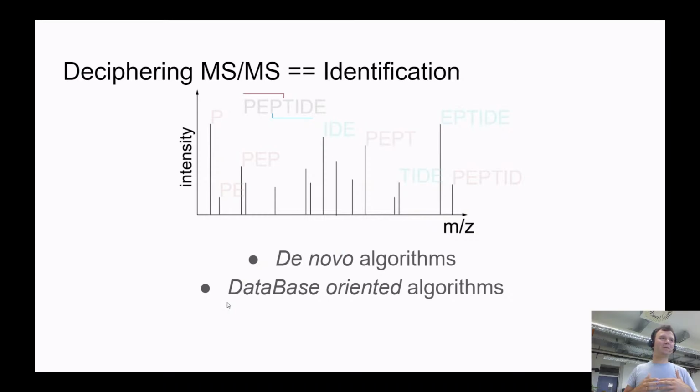Let's say we're analyzing some unknown species, and we're analyzing its transcriptomics. Based on the intersections of the fragments, using different methods, we can reconstruct the whole transcript without knowing which species we used. But if you're using transcriptomics of human samples, that doesn't sound like a very optimal way to do it. So what we can do is align all these transcriptomic fragments on the human genome and find out where these fragments are coming from.